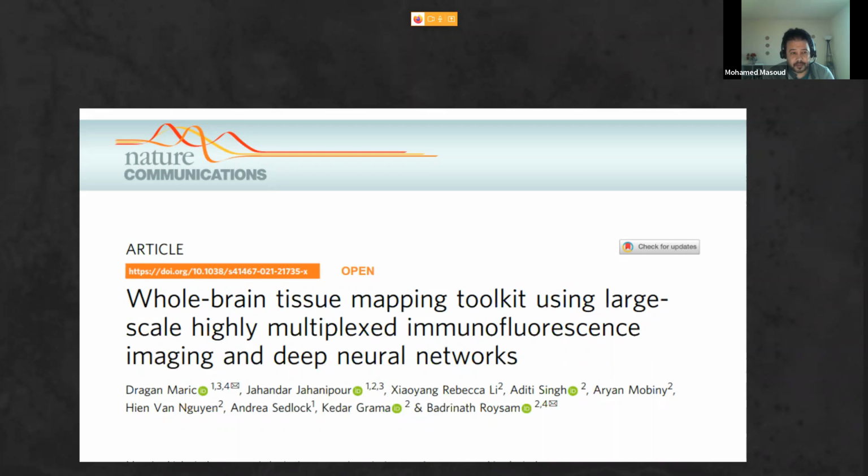When we get a slice from the brain, we need whole-context analysis in order to get the right insight into the cells in this tissue. So the authors had to use validated immunolabeling protocols that are capable of imaging large panels of biomarkers across this large brain tissue.